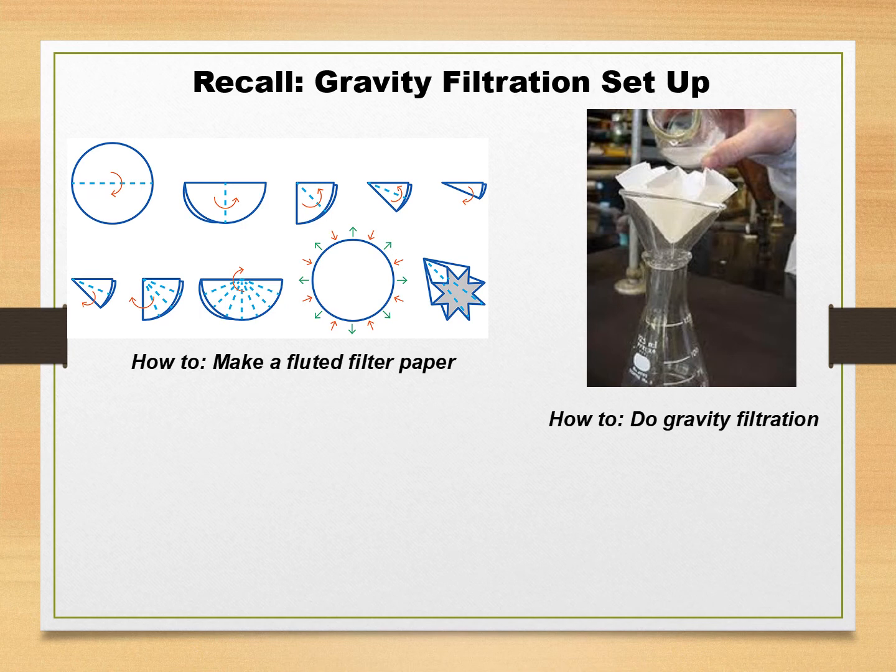And then to get rid of the magnesium sulfate, you can simply undergo a gravity filtration. To do a gravity filtration, we need to prepare a fluted filter paper, which is prepared by folding the filter paper, Whatman filter paper usually, into 4 folds or 5 folds, which is okay either way. So you can just fold it into half, fold it into quarter, and again you can fold every quarter into half.